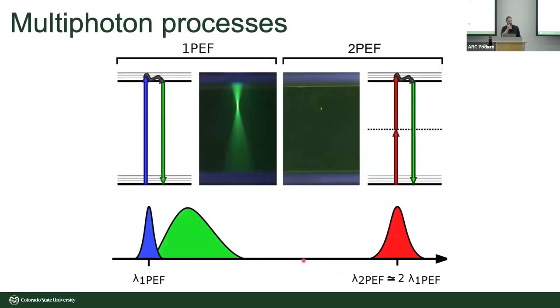So this is just a quick example to show you the difference between 1 photon and 2 photon. I promised you I would show you this kind of hourglass shape. So here it is. Again, we have our favorite molecule, maybe it's GFP. If I'm illuminating under 1 photon excitation, many of you are probably used to seeing something like this, where I have some illumination bandwidth and I have an emission spectrum. There's a broad range of optical frequencies that are emitted by this molecule, and that forms this emission spectrum.